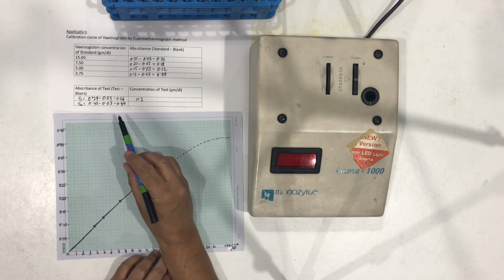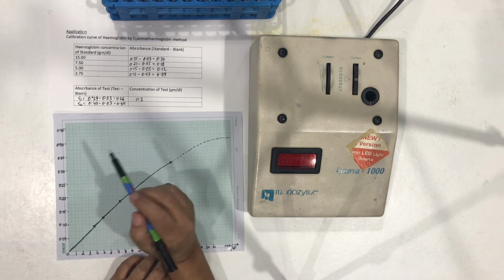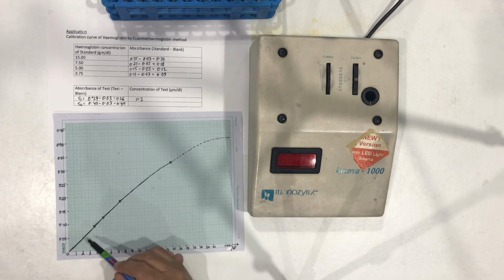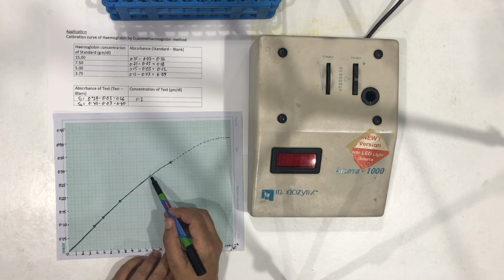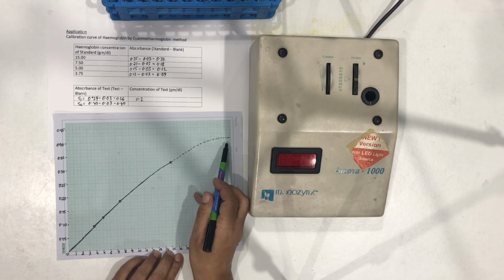Sample 2's absorbance, that is 0.40, falls in the flat or non-linear region of the curve. The curve is linear out here. From here it starts deviating and becomes completely non-linear over this region.